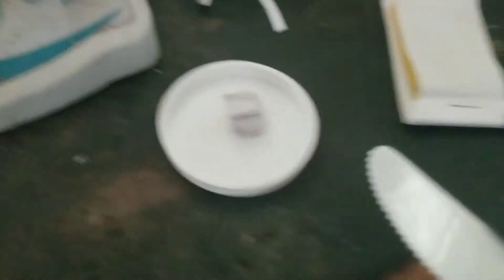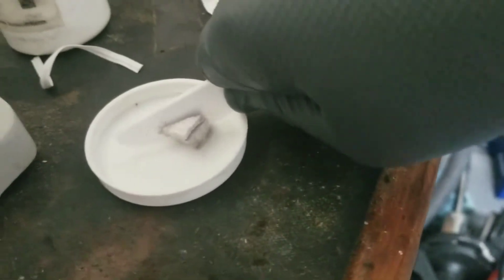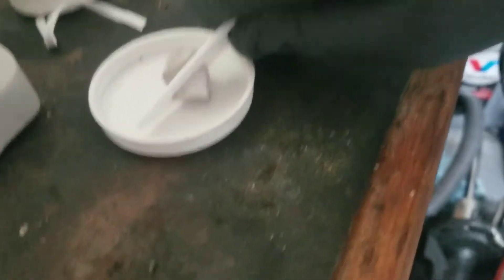I just wanted to show you something really interesting about sodium. It's so soft that you can cut it with a butter knife, and this is just a plastic butter knife. So I'm actually cutting that with this plastic butter knife. It's really, really soft.